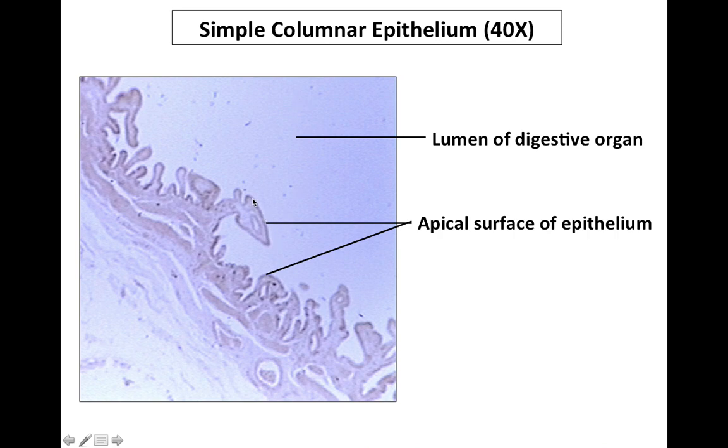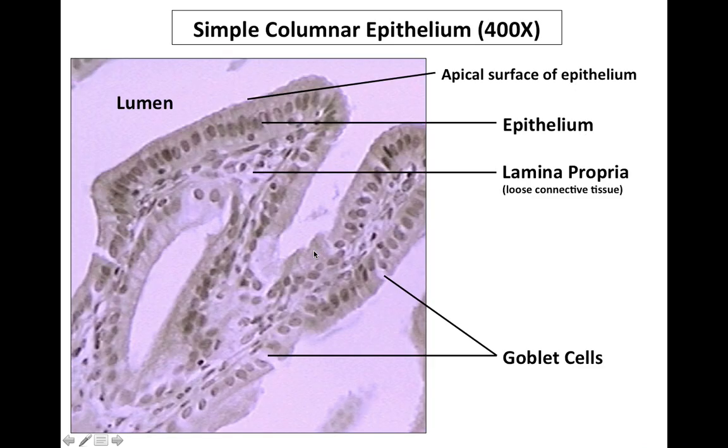We're going to zoom in right here to take a look at what is known as the apical surface of the epithelium.